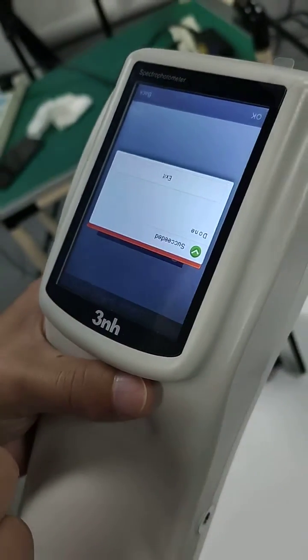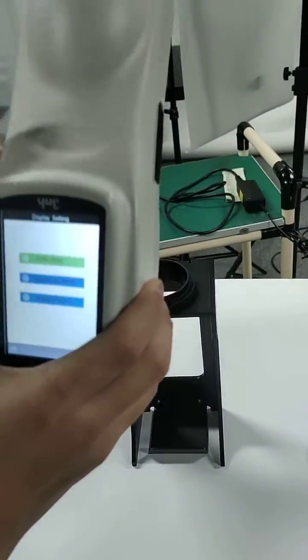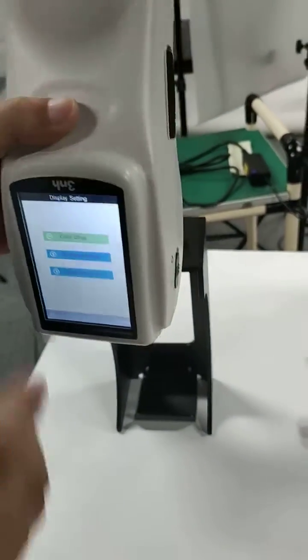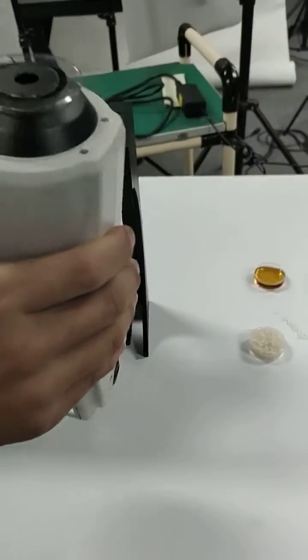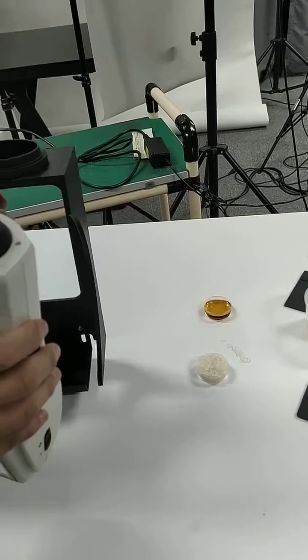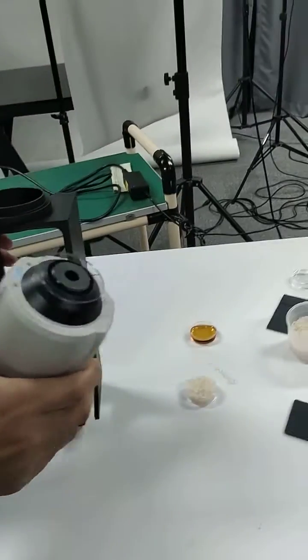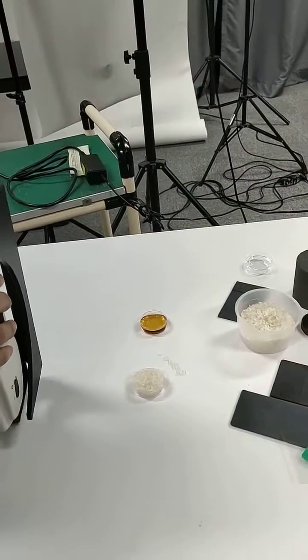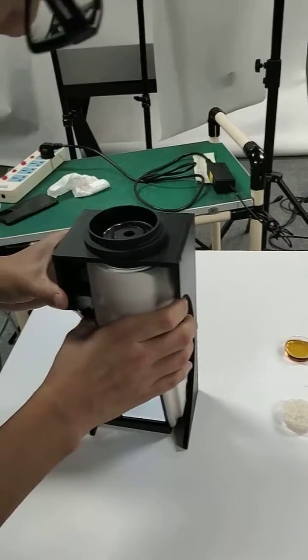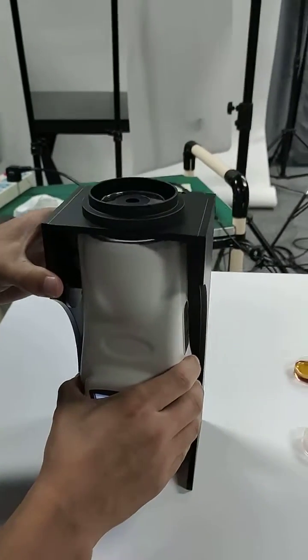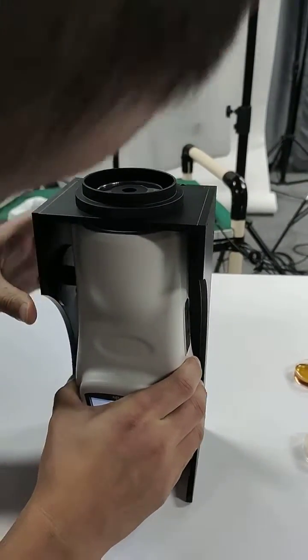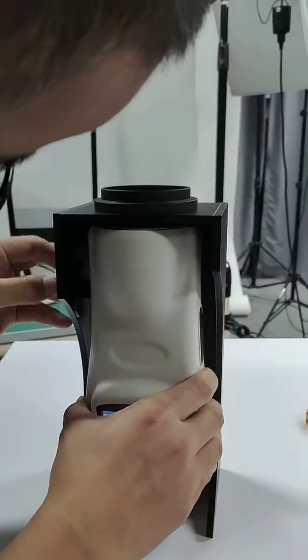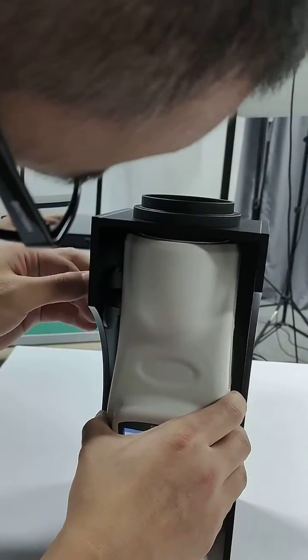Okay. Then we can see it like here, like this. And then we install the instrument into the universal test component and fix it, fasten it here.